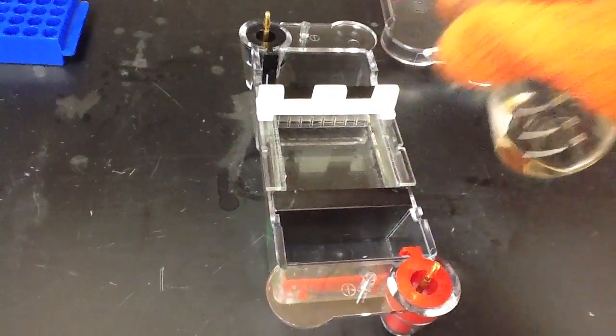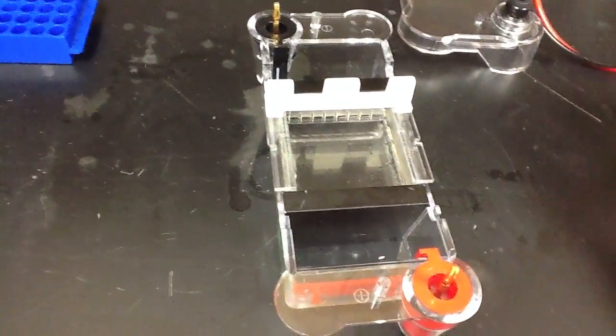Once the agarose solidifies, we cover the gel with TBE buffer and then remove the comb. Removing the comb reveals wells, which are cavities in the agarose into which we can place our DNA samples.